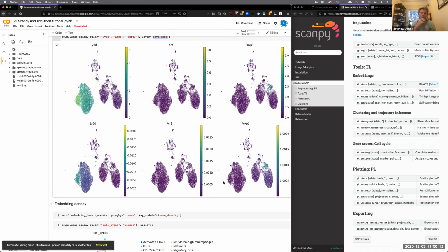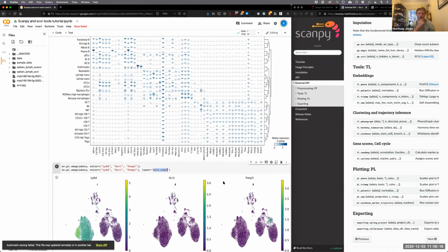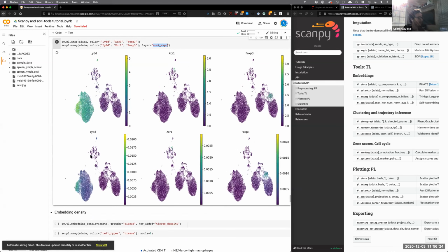The other question is, why do you think that the scVI expressions are like an order of magnitude or two less than the raw counts? Right, so that's because the default output of the scVI expression is scaled to sum to 1, and these were scaled to sum to 10,000. So there's an option in the function where you can scale these to 10,000. Gotcha. Yeah.